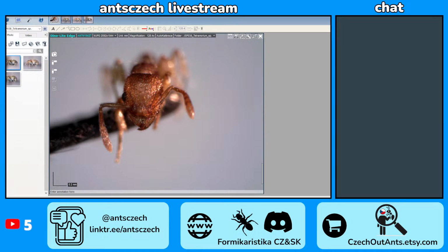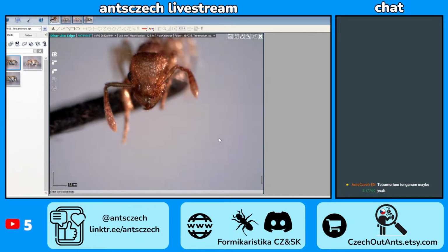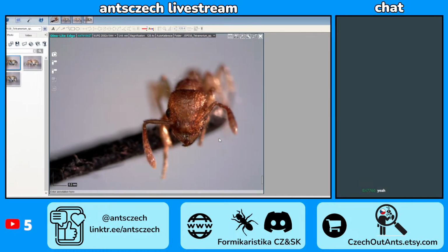Yeah, maybe he can help us. But I wanted to do it myself first. At least try it myself first before asking anyone for help. For Tetramorium, I'm always happy if I even get the group. If the answer is Pilosum group, I always give up.